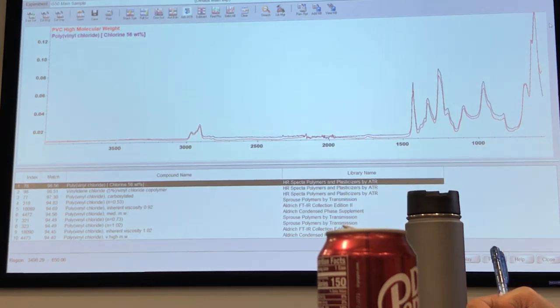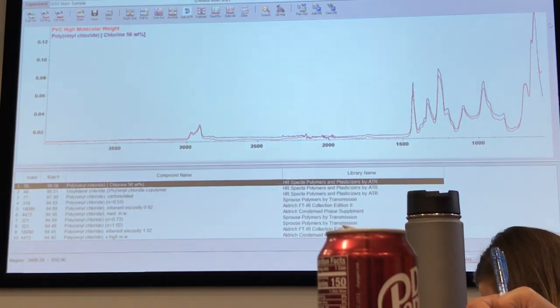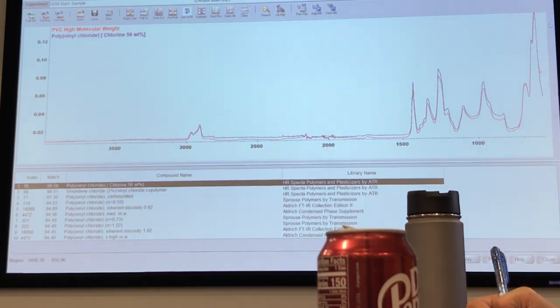That's why it is important that we make a judgment even before sample analysis about how we are going to analyze the sample and get good quality data out. If you really want to run automation for everything, what I recommend is to create a small subset library for the materials you're looking for in reflectance.